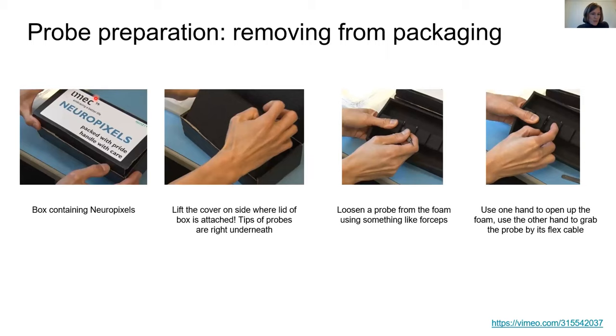You will get your probes in a box like this one. One thing to remember is the tips of your probes are pointing to the lid of this box. So it's very important to open them in the right way, namely like this. You lift the lid of the box like that. The probes are stuck into this foam here. Sometimes they're quite difficult to get out, so you may want to loosen them first, for example with forceps like so. Once you've done this, you can hold with one thumb one part of the foam away and then grab the probe with your other hand by its flex cable. This is a secure way of getting the probe out of the box.